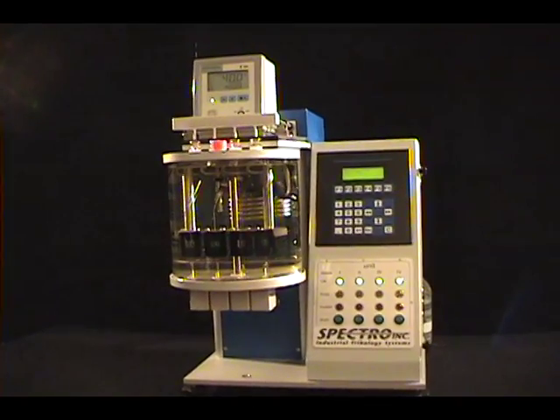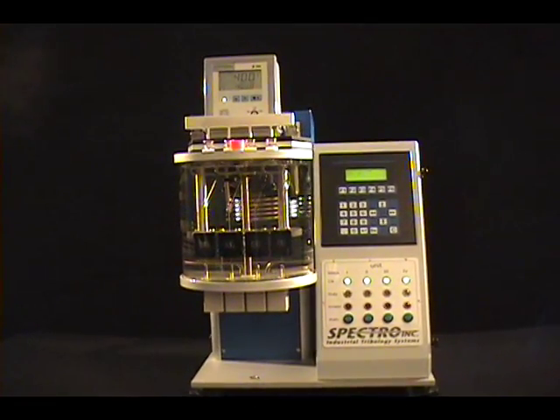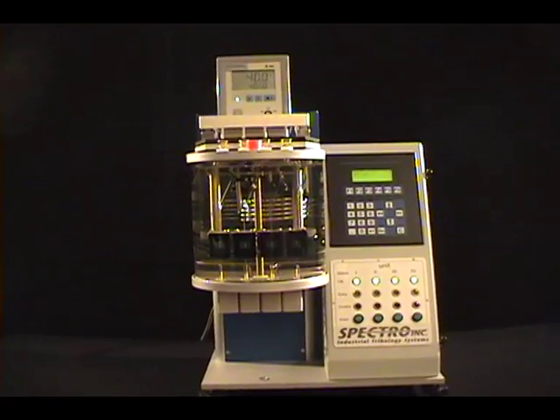The entire measurement cycle, including cleaning, takes three to four minutes, making the Spectra Visc ideal for a high capacity measurement facility.